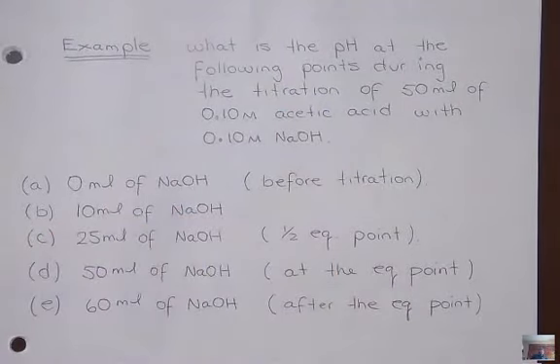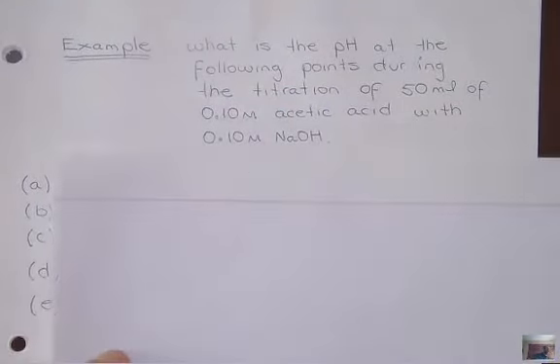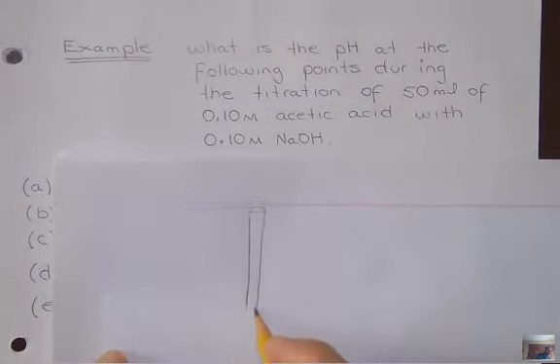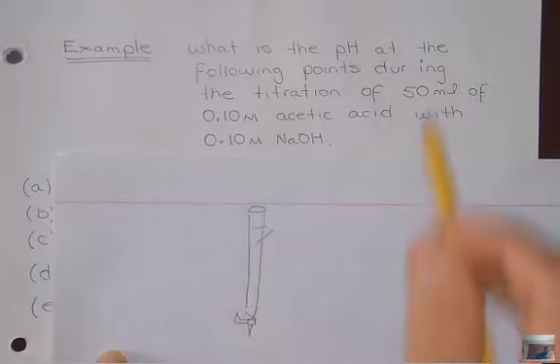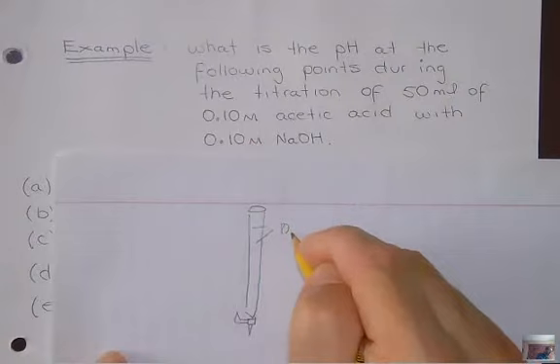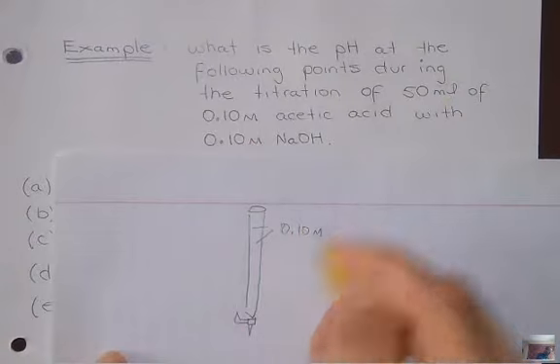So let me just draw the setup for you super quickly. Okay, I have my burette. The burette is filled up with sodium hydroxide. What concentration? 0.1 molar.